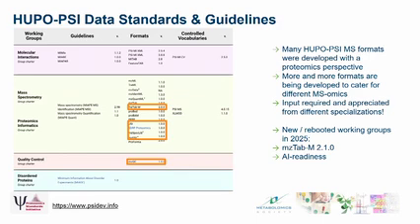The Universal Spectrum Identifier, that was also briefly mentioned, allows you to cross-link spectral information into repositories going back to the raw data files and identifying which spectrum they originated from, if you, for example, have identification information. SDRF, currently for proteomics, tries to establish a sample description metadata format, but is also currently being extended towards metabolomics as well, which allows us to also cater for multi-omics experiment setups, where we don't want to redefine the same sample description for all of the different omics, but we can basically just create one SDRF, or maybe have an SDRF core, and then for proteomics and metabolomics, and then reuse that in the different specialized reporting formats.